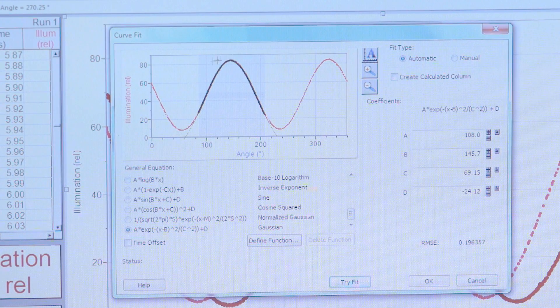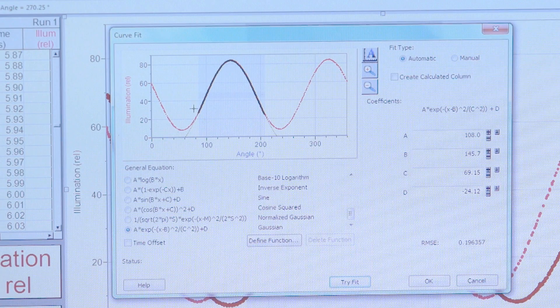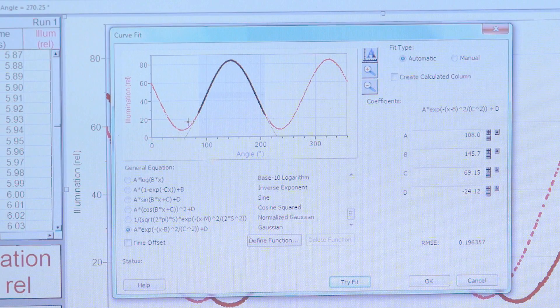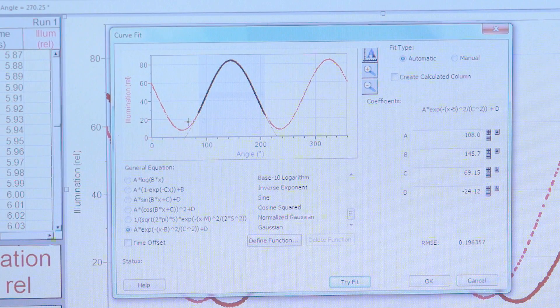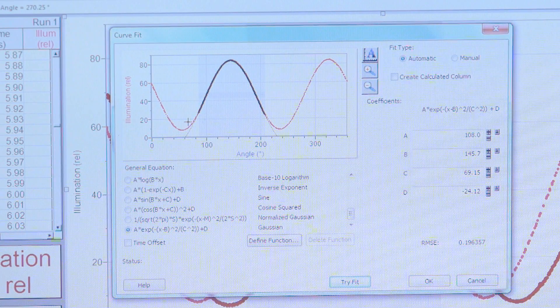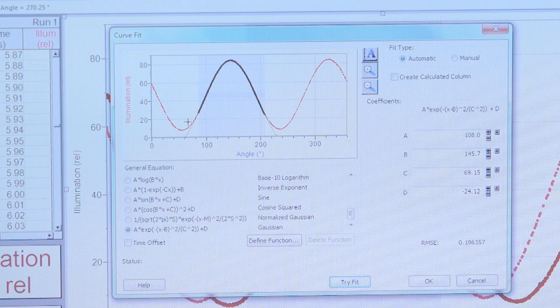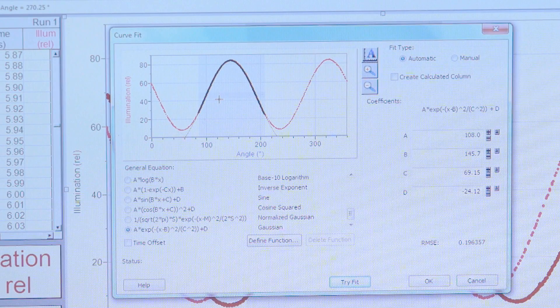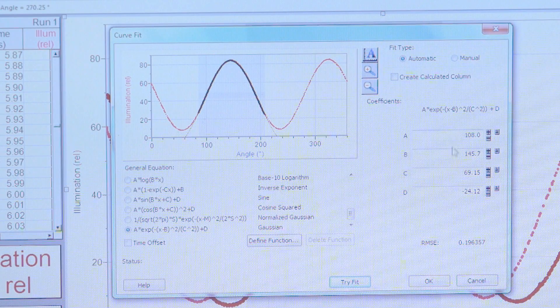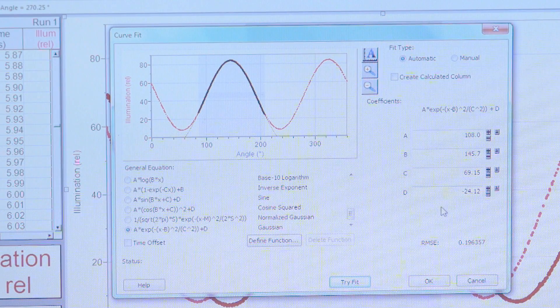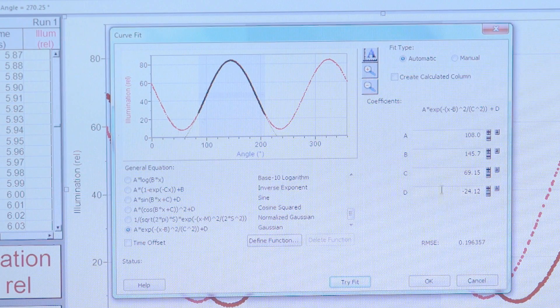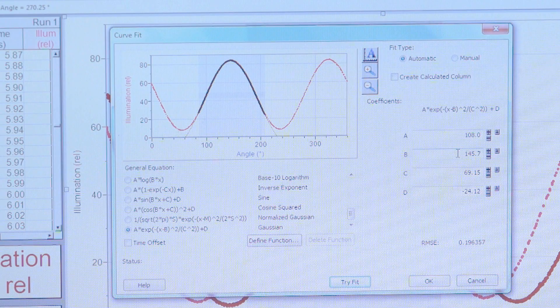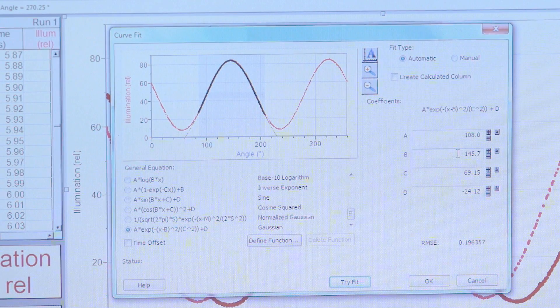Notice in the window here a black curve fitting line has shown up over your waveform. You want to make sure that that black curve matches your data. If it doesn't, restart the curve fit. Since it matches quite nicely in this instance, we're going to look at the coefficients. The coefficient of interest here is the b coefficient. This value gives us the angle at maximum illumination for the blank.